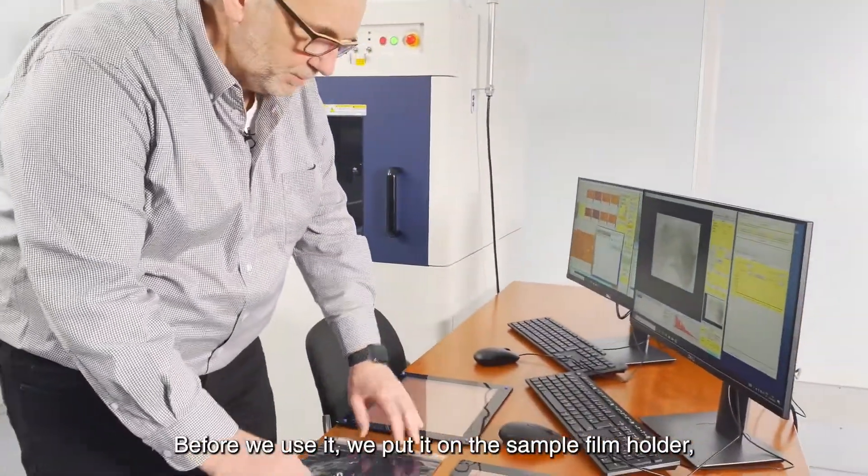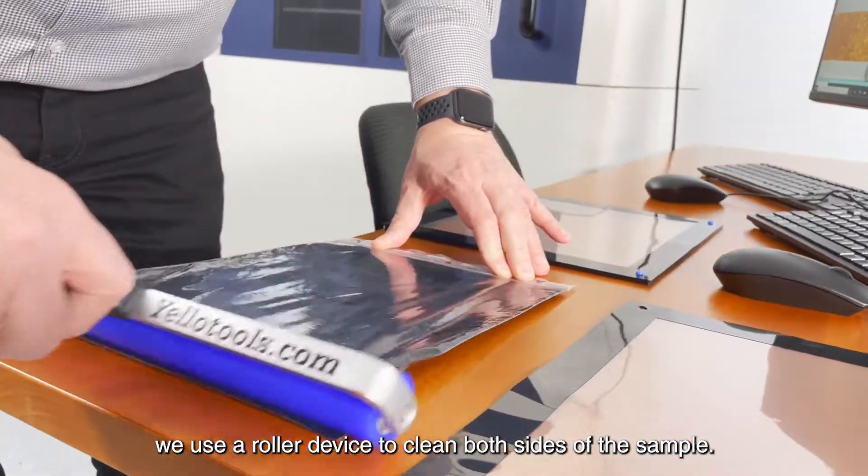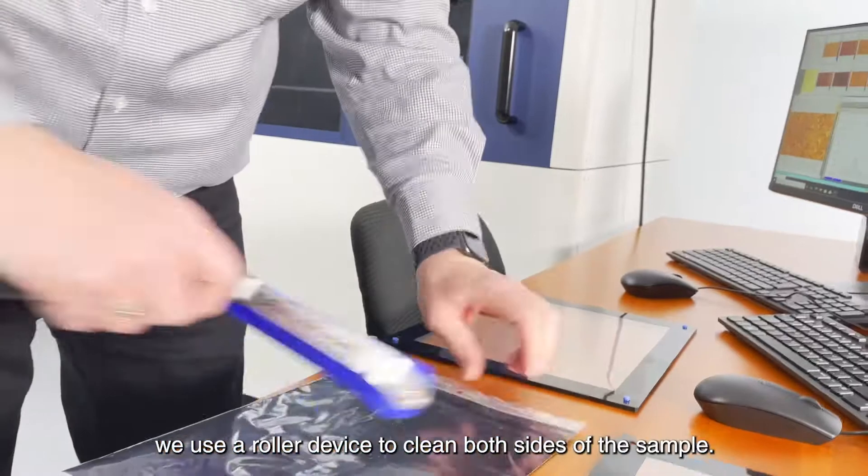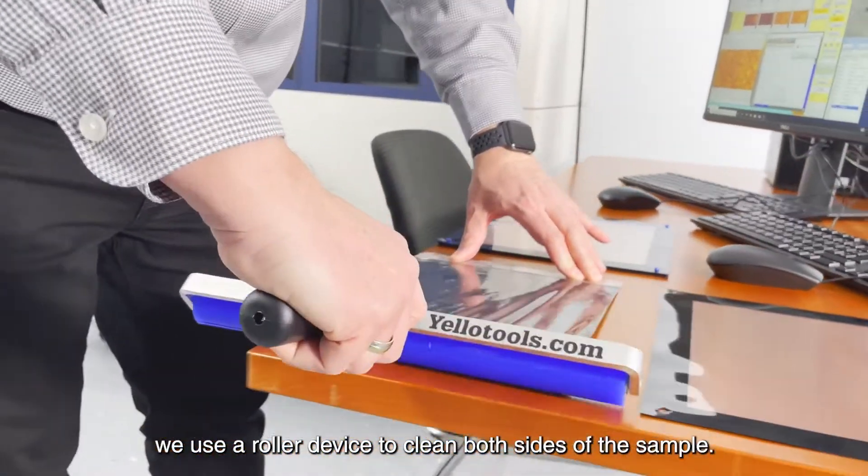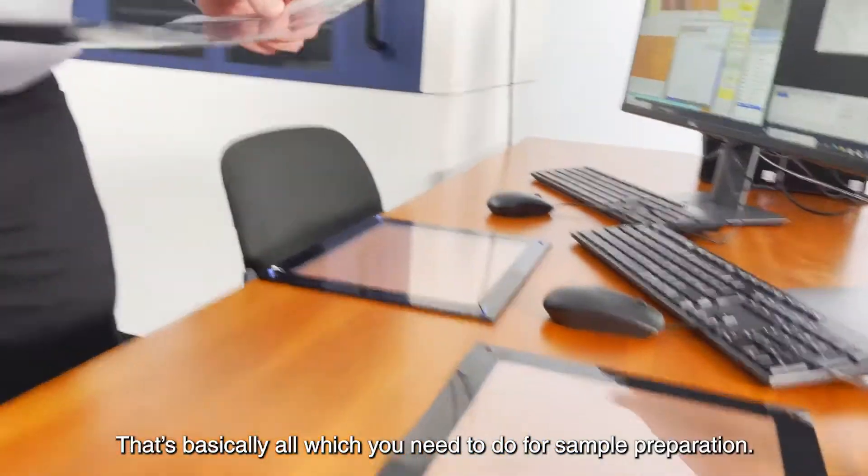Before we use it and put it on the sample film holder, we use a roller device to clean both sides of the sample. That's basically all which you need to do for sample preparation.